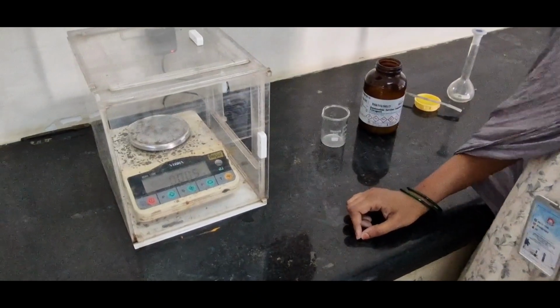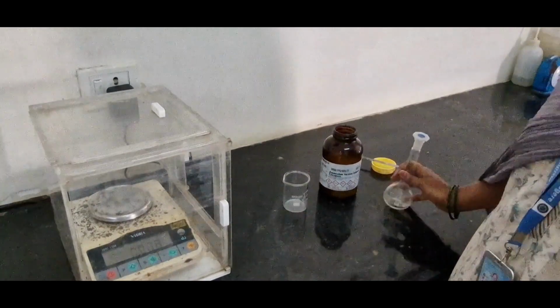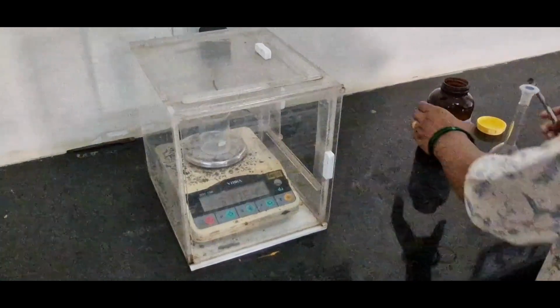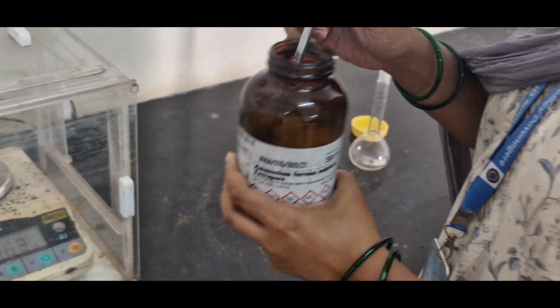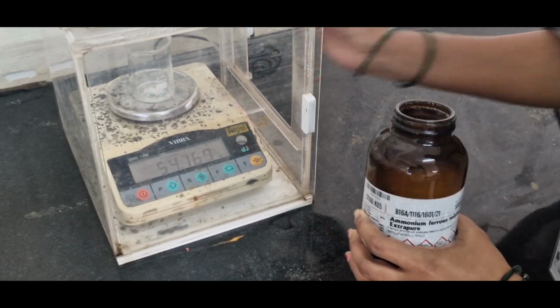So this experiment consists of two parts. Part A consists of making FAS solution of 100 ml. For that, first we have to weigh FAS. So take a glass beaker. This is FAS, ferrous ammonium sulfate, and weigh an appropriate amount of FAS.